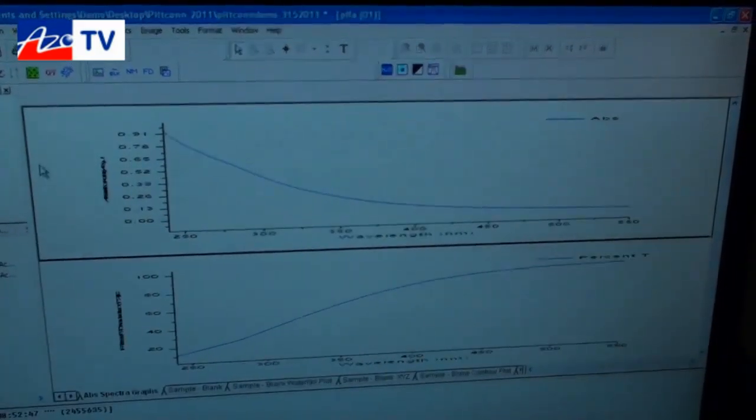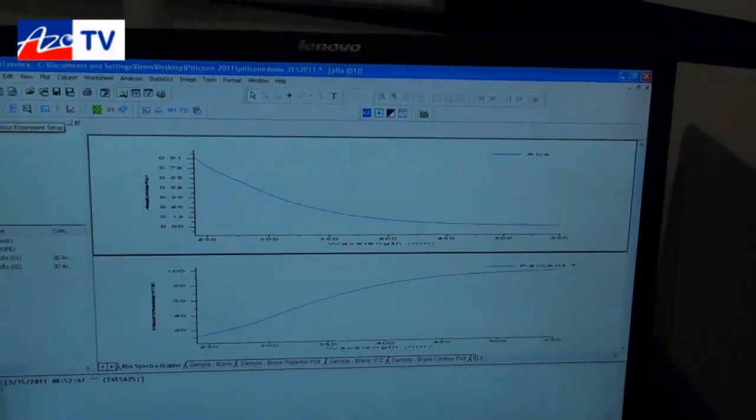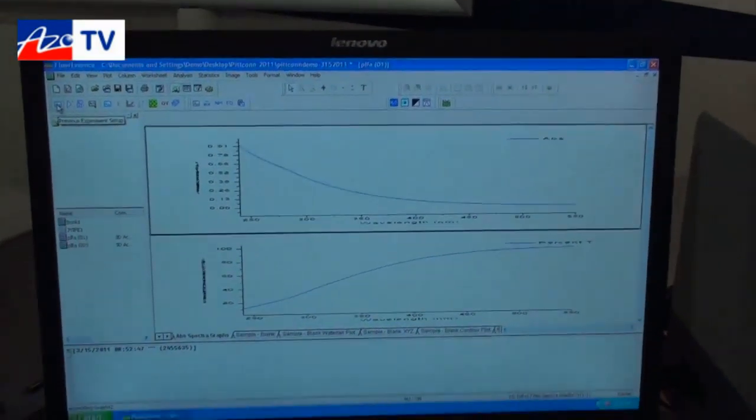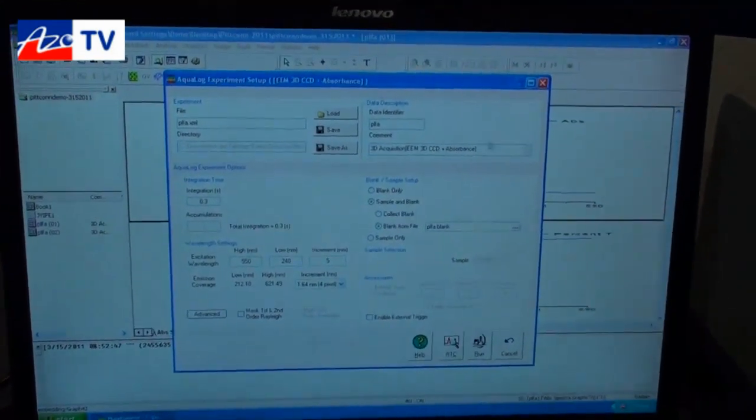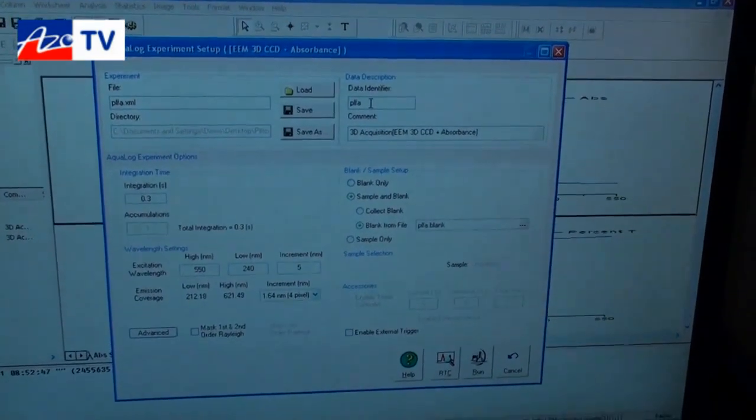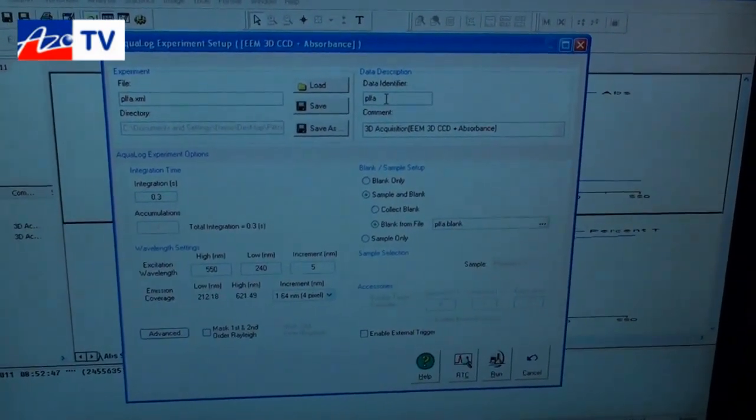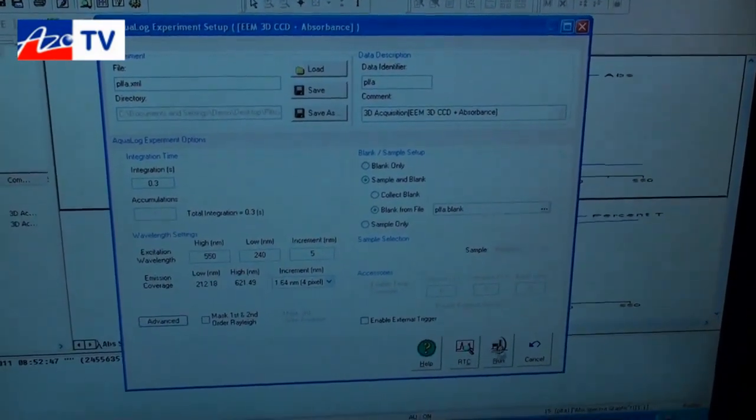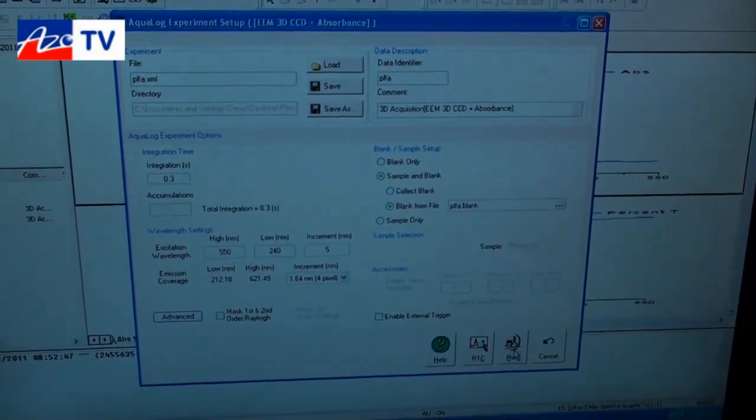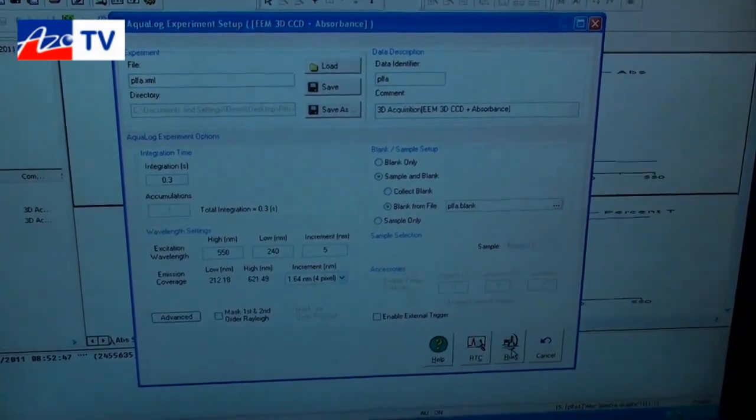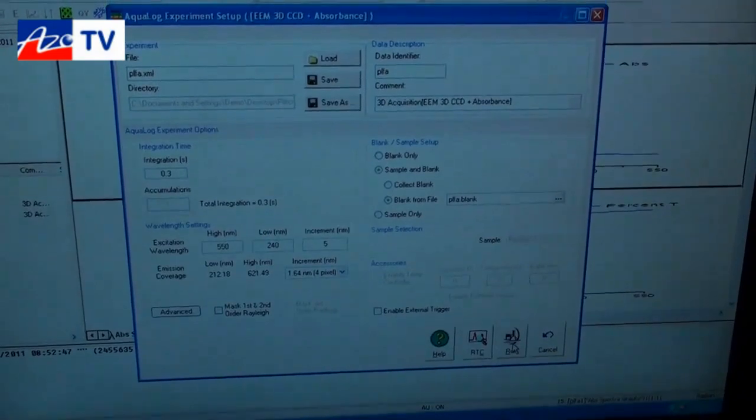As we mentioned before, the data collects roughly a hundred times faster than anything that's on the current market today. So we'll give you a brief demonstration of a collection of the sample. This sample is actually a standard sample from the International Humic Substance Society. It's known as the Pony Lake Fulbic Acid Sample. And so many water quality researchers use this sample as a target to validate their multivariate analysis of the excitation emission maps once they've been corrected.